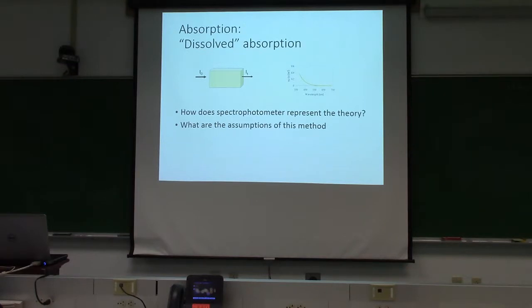Yes. So what I do is I measure it, right? I melt it, I measure it, and then I filter it and I measure it again just to make sure. It turns out that often you may be making some colloids, but the melted sample is closest to what it was originally. If you refilter it, it's lower. So the colloids, even though they have formed, contribute very similarly to absorption as they did before they were colloids. But you should do it for your samples to make sure that's the case. The best thing to do is just to measure them fresh if you can.